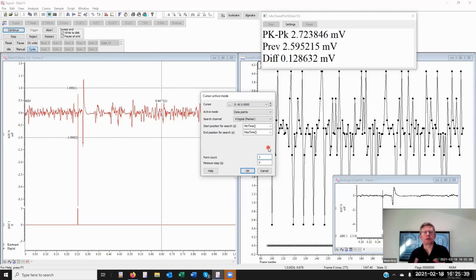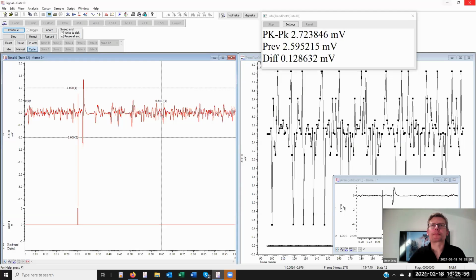When I say the third, it could be any number, but imagine you're always after the electrical stimulation, which is always your third marker. So we're jumping to that, and we want to use that as a reference time for taking other measurements. I'll say OK, and then I'm going to move on and start continuing with the recording before generating another XY plot.